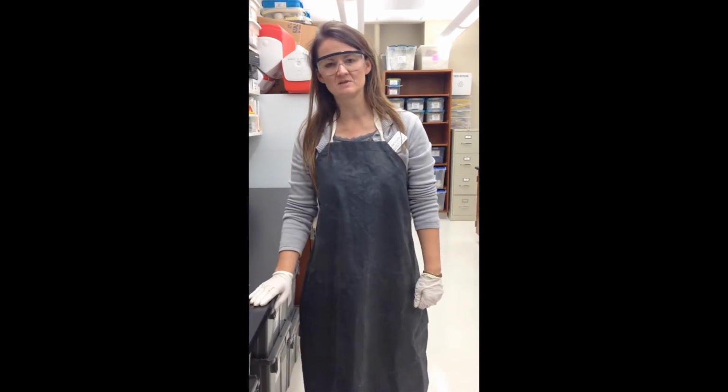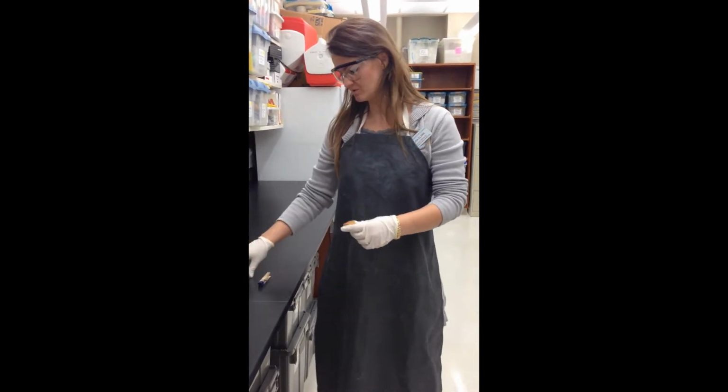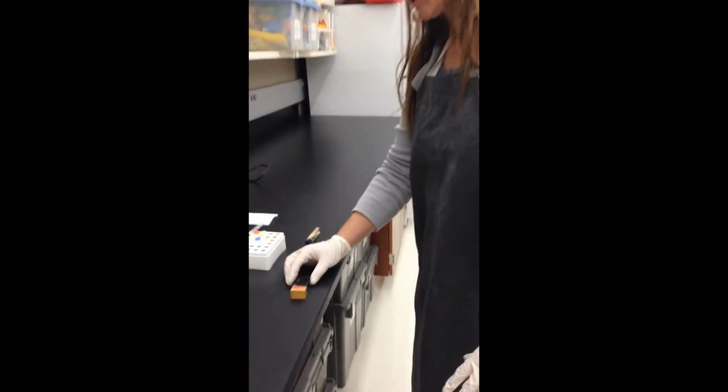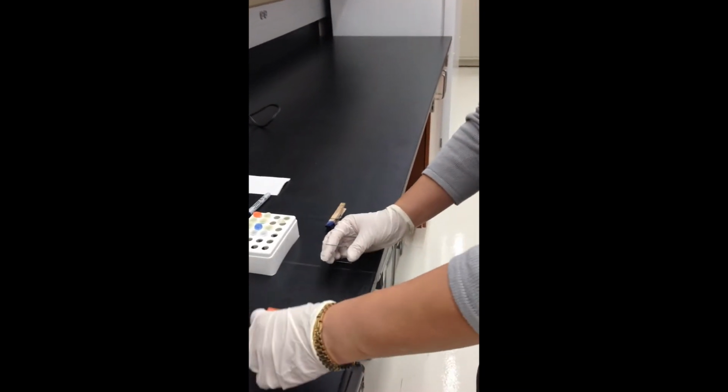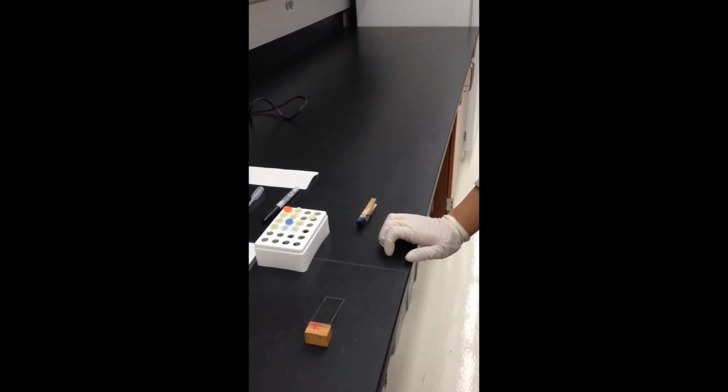Today you're doing the chromosome spread lab. Sometimes this lab is called cell splat. First thing you're going to do is set up your slide. Your directions will tell you to set your slide up at a 45-degree angle, so we have this block that you can set your slide up on.